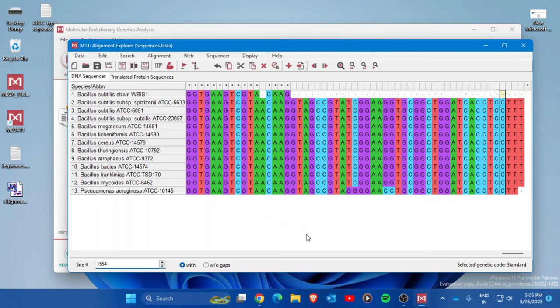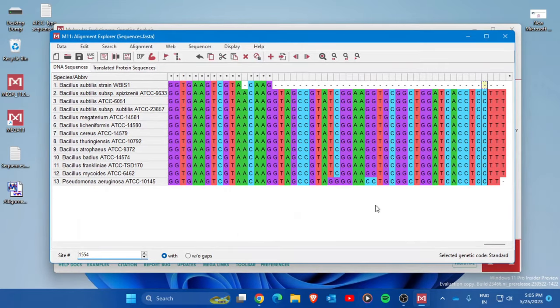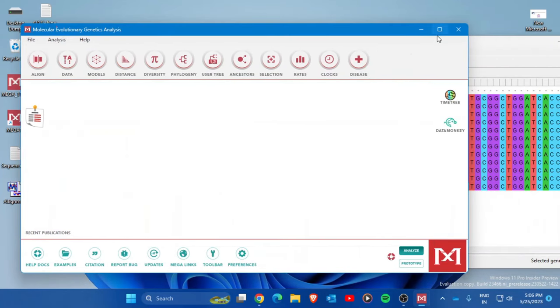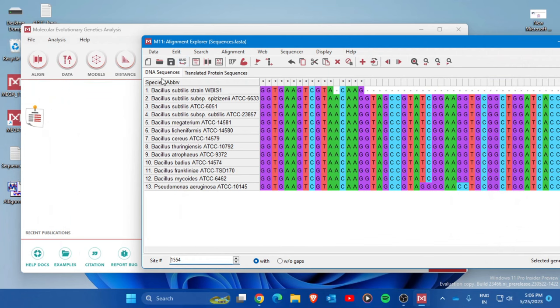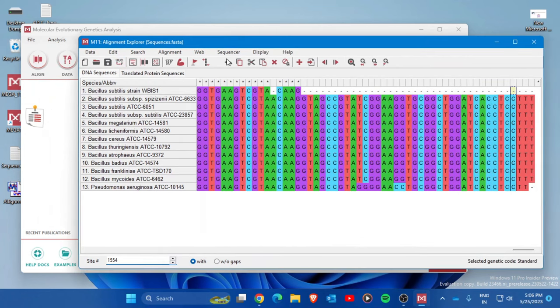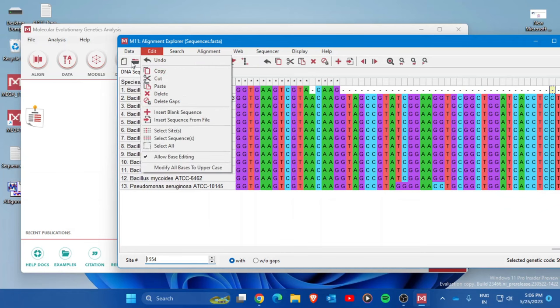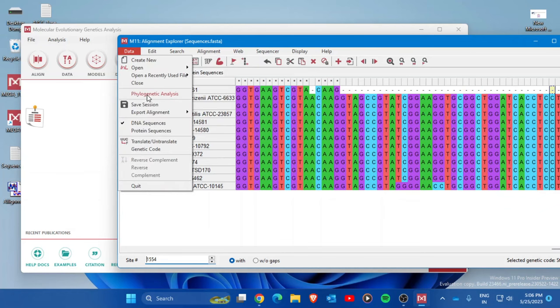The alignment is now complete and appears on your screen. All sequences are arranged using multiple sequence alignment. Now focus on the main MEGA interface. Go to the Data tab and click on 'Phylogenetic Analysis'. A new file will appear on the main interface.